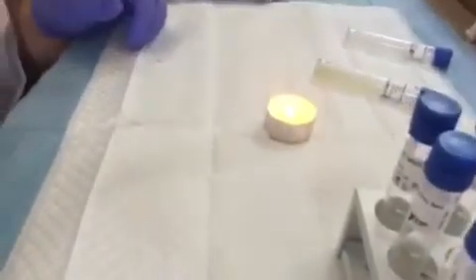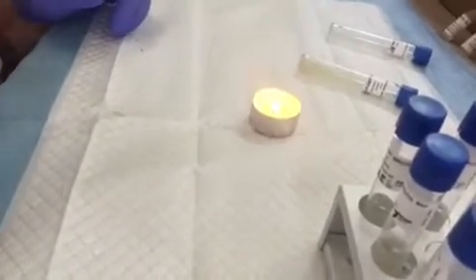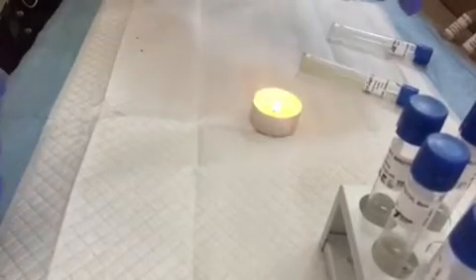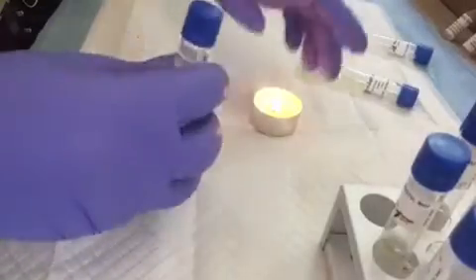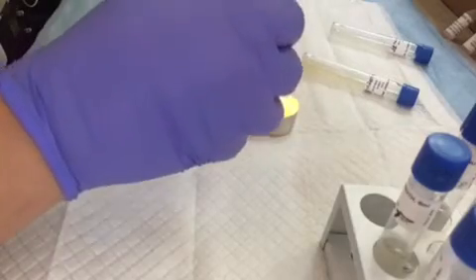Hello, Marianne Vertiflor. Here we go. So we are doing the environmental influences of microbial growth, salt tolerance testing, and this is going to be on exercise 2. First we're going to get the nutrient broth. Just going to flame it over the lip.